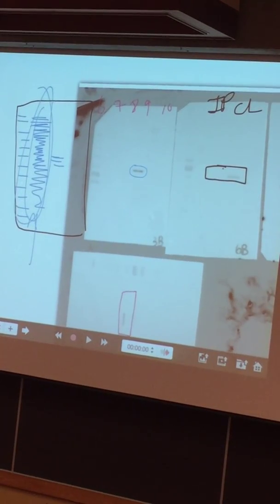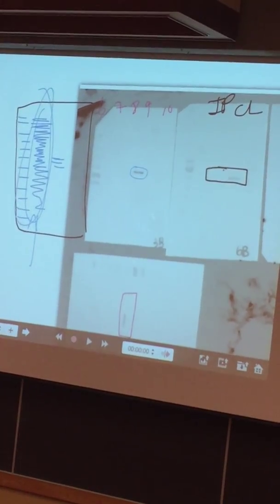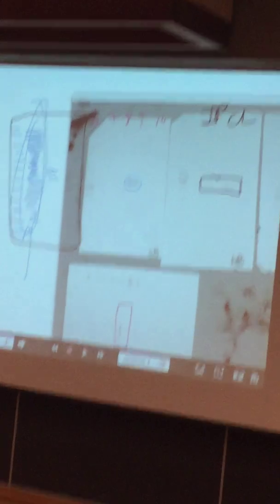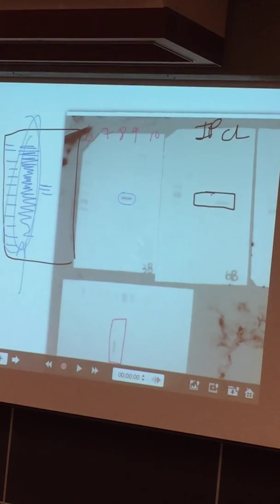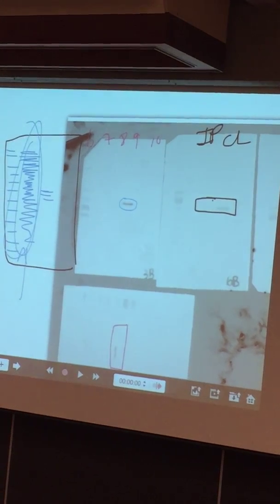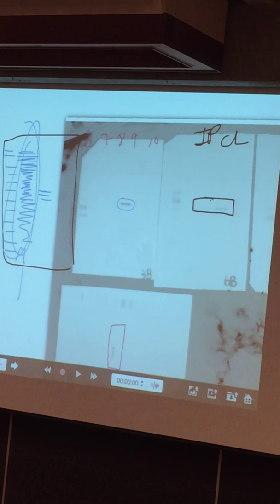Westerns, of course, the extension of Western blotting, immunodetection, ELISA assays, a lot of clinical assays for antigens, viral infections, and things like that. So in the clinical setting, it becomes very important to use something that is very specific and can, in fact, pick up one antigen out of mixtures of many. So in that sense, Western does work out.